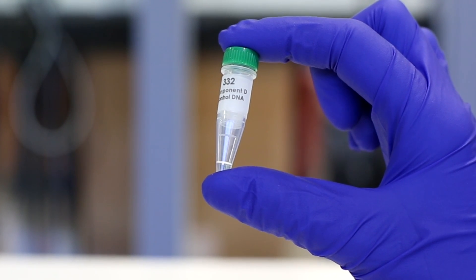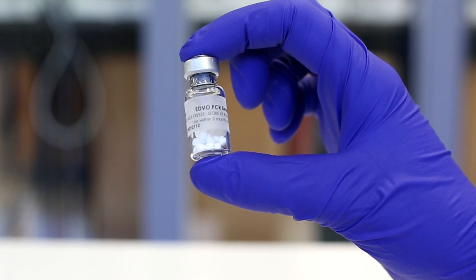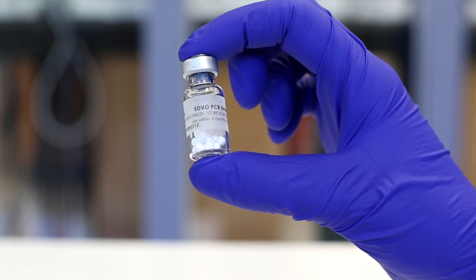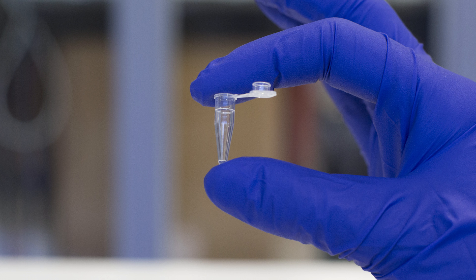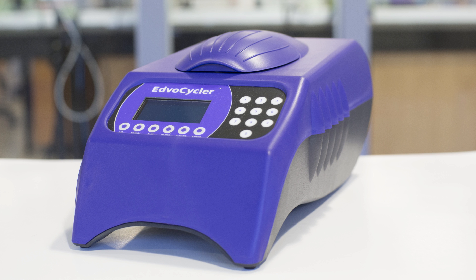You will need a DNA template to amplify, a primer mix, PCR Edvo beads containing TAC DNA polymerase, the four free nucleotides, magnesium, and buffer, a 0.2 ml PCR tube, a micropipette and tips, and finally an Edvocycler.